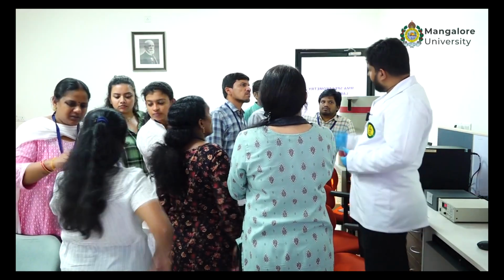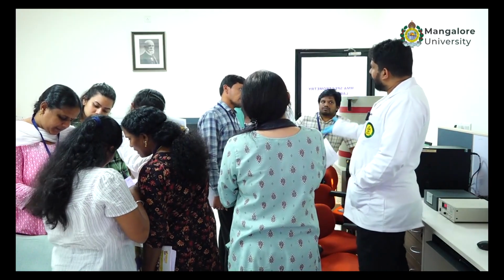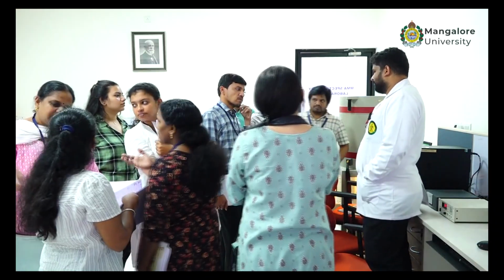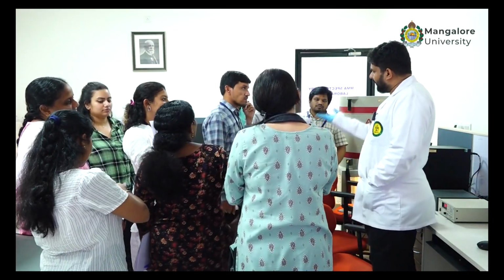Maybe that is also done. Or else I can take the background MDA by half, for 30,000 seconds. It should not be linear all the time, but approximately half, maybe 1 or 2 points here and there.